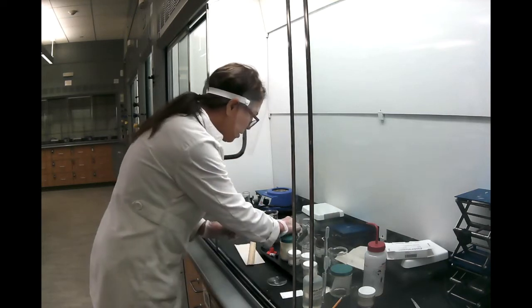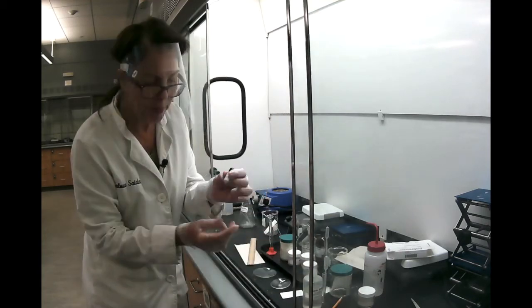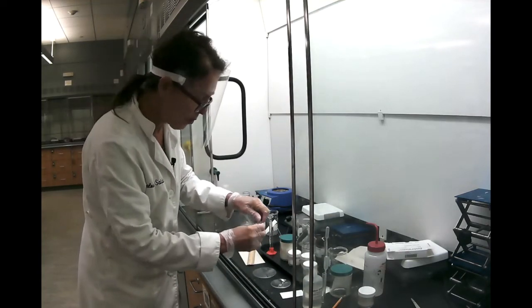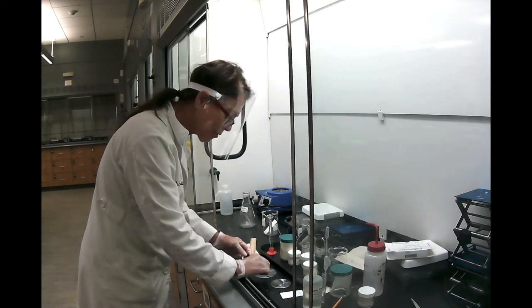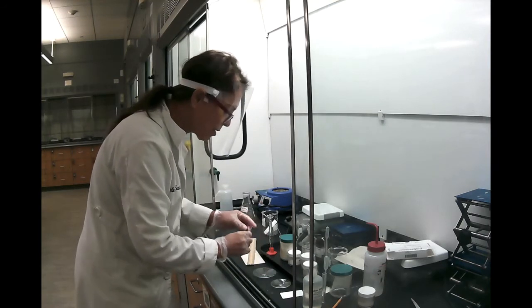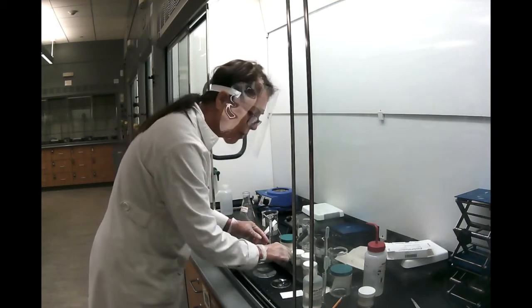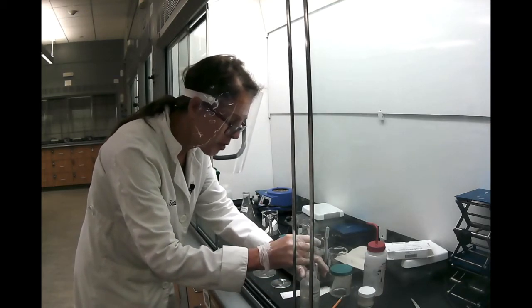And now I'm ready for my unknown. The unknown here is a powder. Do the same procedure: put a little bit of the unknown, again about the size of a rice grain, a few drops of ethanol, and you spot it on your TLC plate.